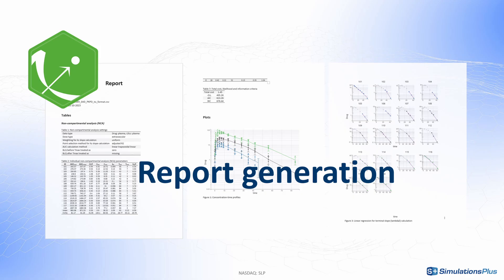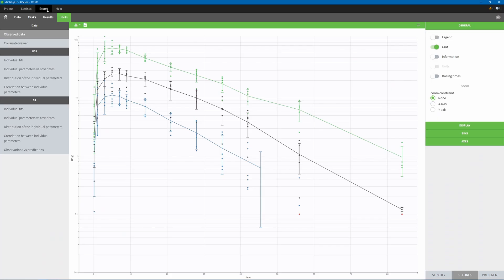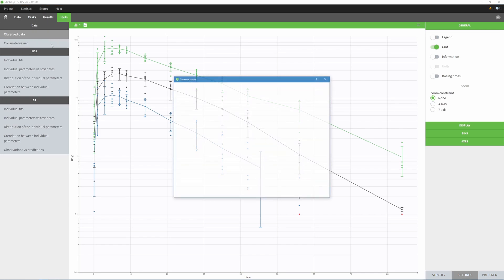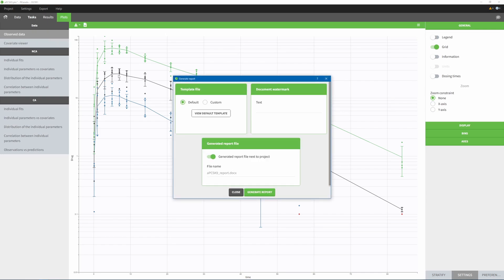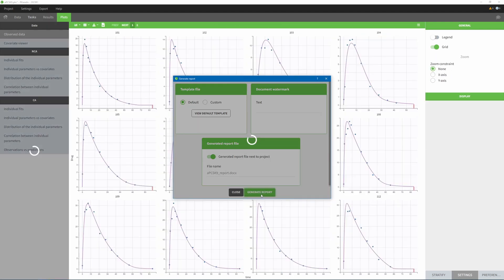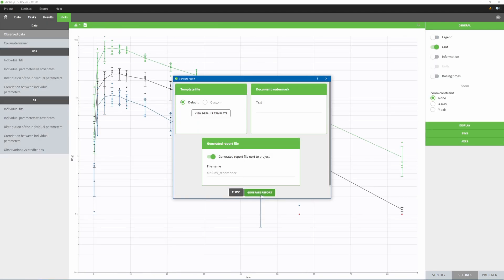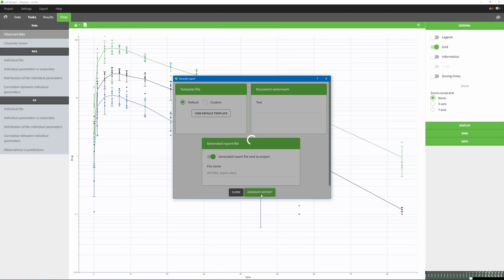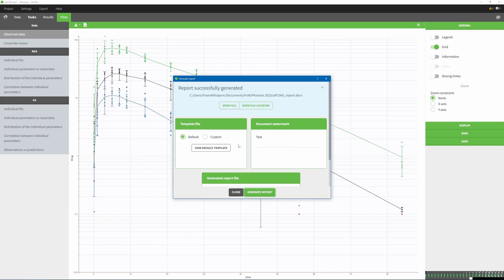Another major improvement is a brand new reporting module to automatically generate reports as Word documents with all your analysis results. With the default option, you can generate in just one click a default report containing different tables and plots, depending on which tasks were run.